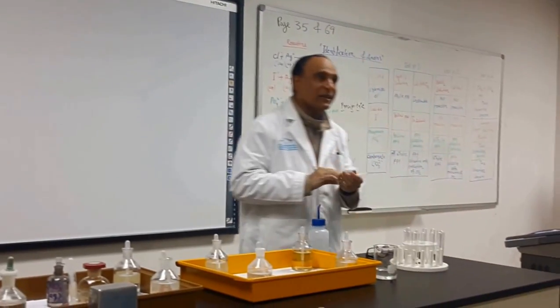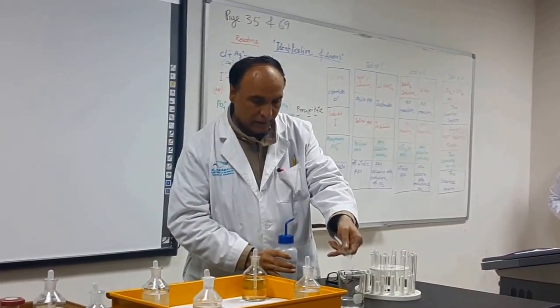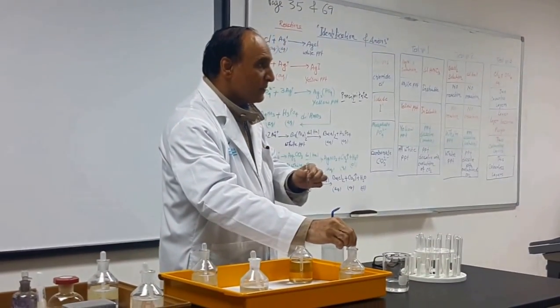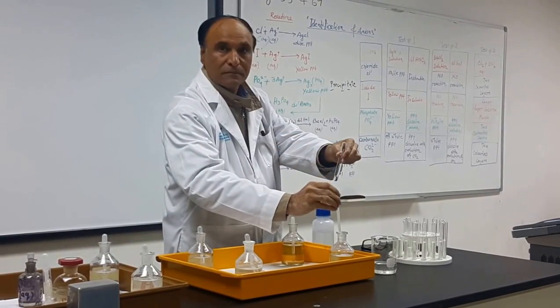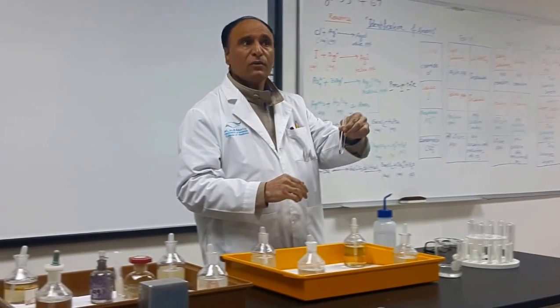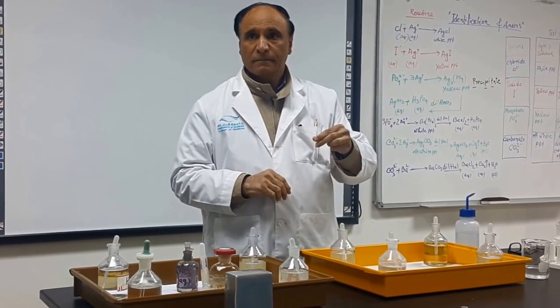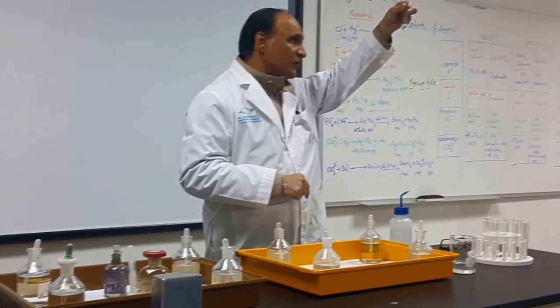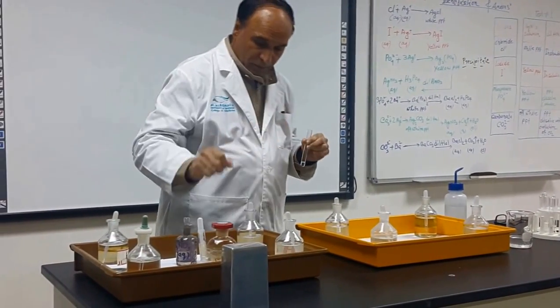So I put it on one side, I take the other test tube, and now I take phosphate. Is that right? Yes. Because I will finish with the phosphate. What does solubility mean? Soluble means it dissolves or it doesn't dissolve. Okay? So I take the phosphate and I do the test number 2, barium chloride.